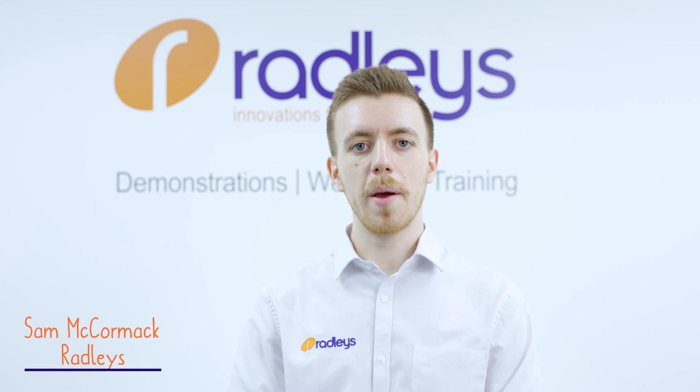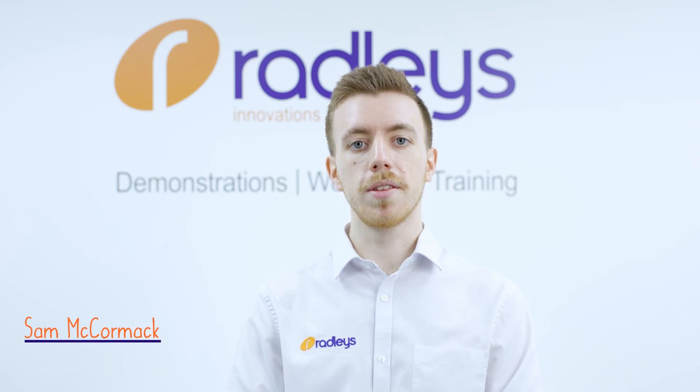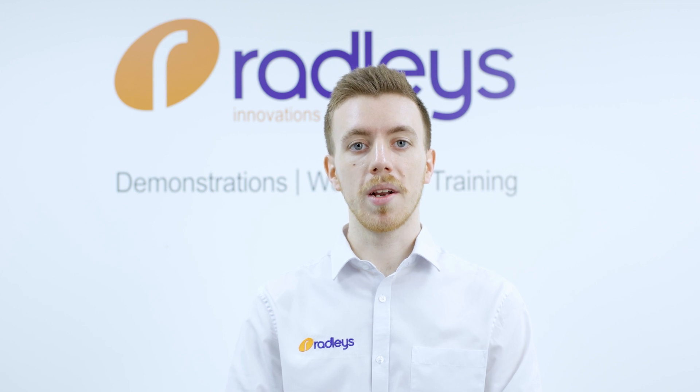Hi, I'm Sam, a member of the team here at Radley's. In this video I'm going to discuss glass joints that are commonly found in the lab. The most common glass joint that you come across in the lab is the ground glass joint.